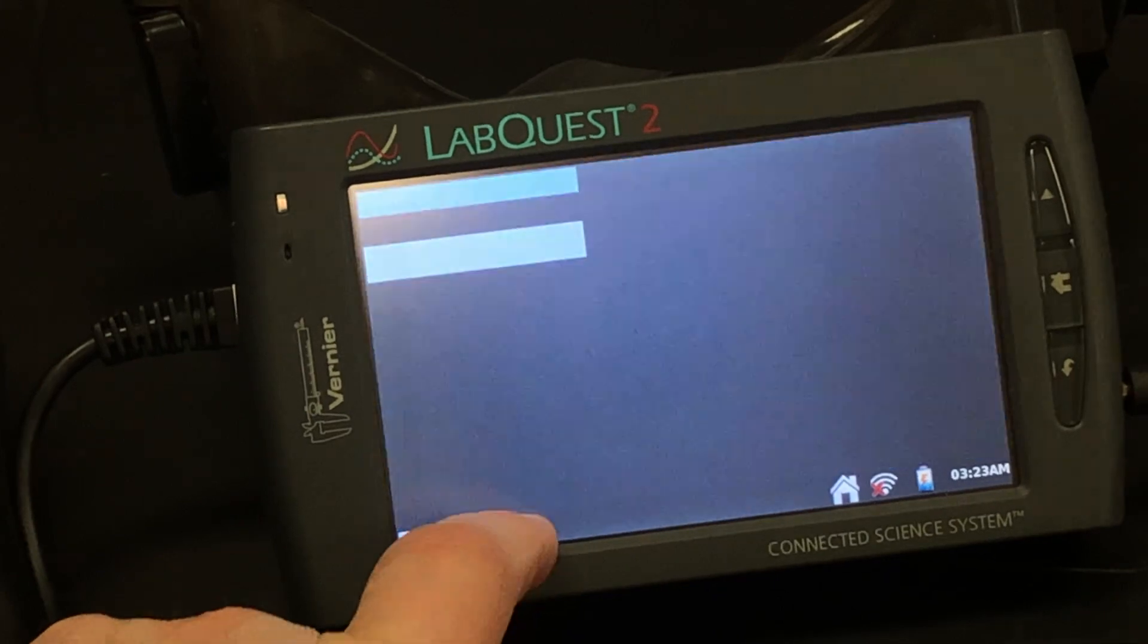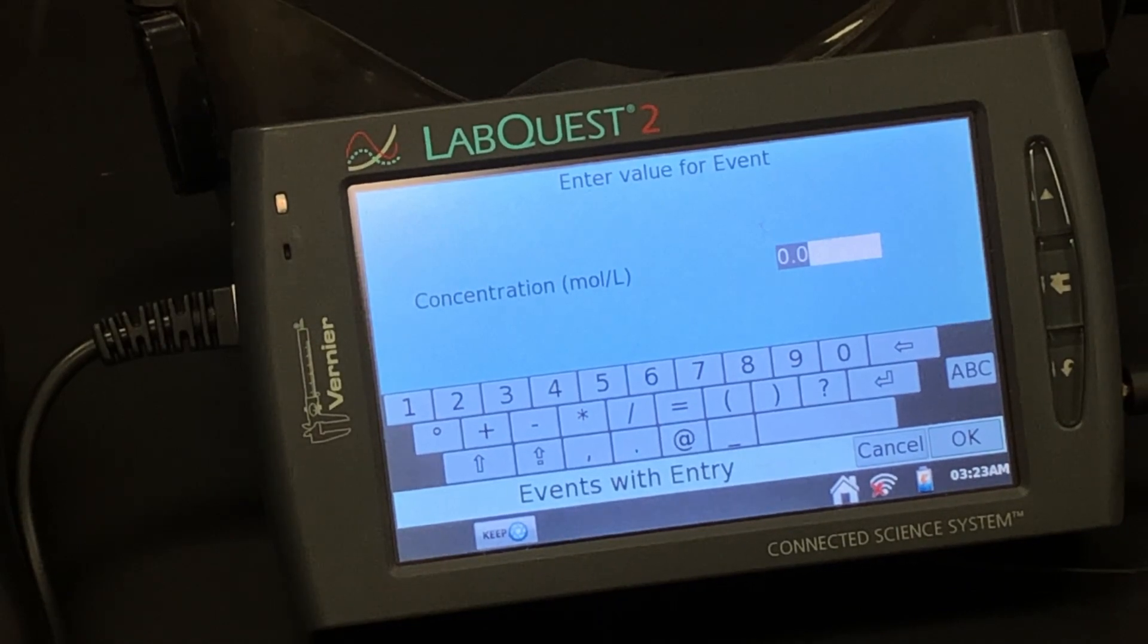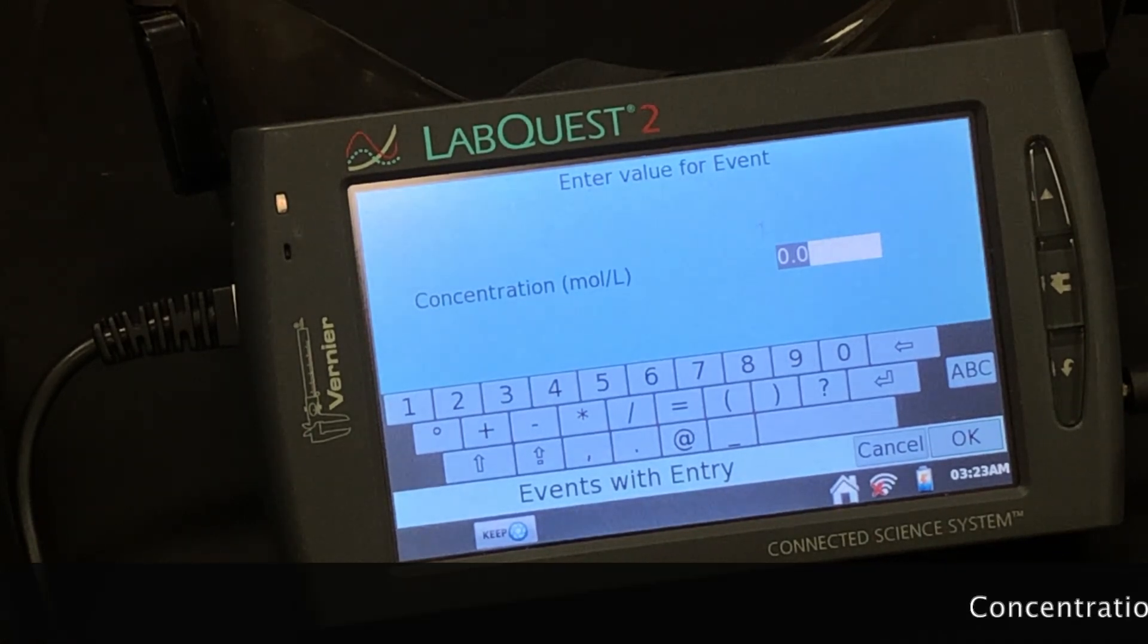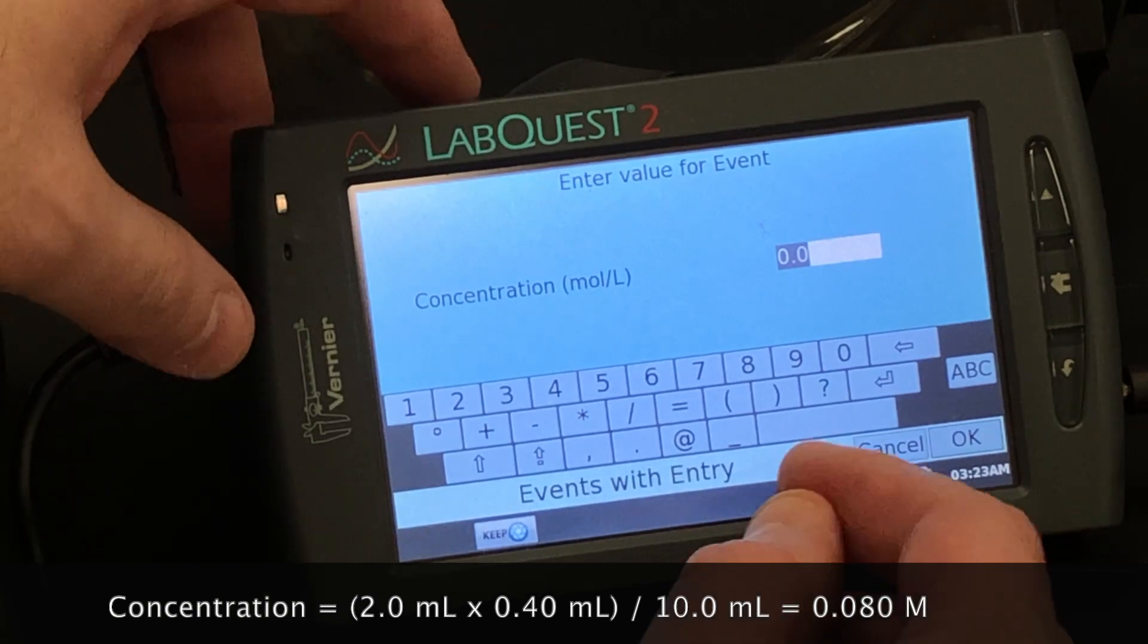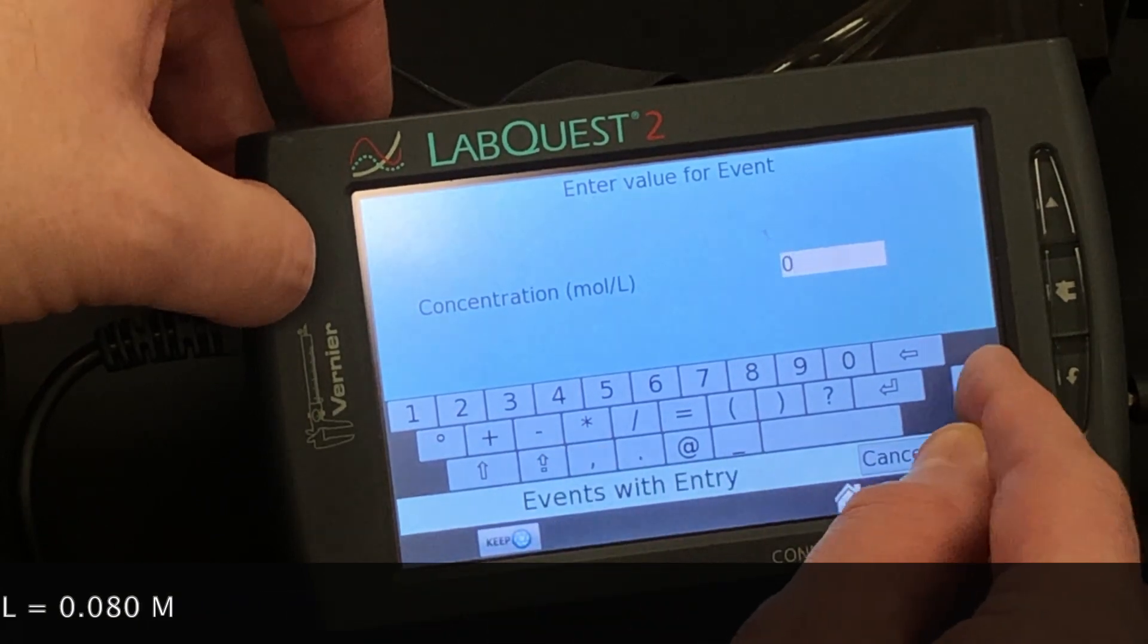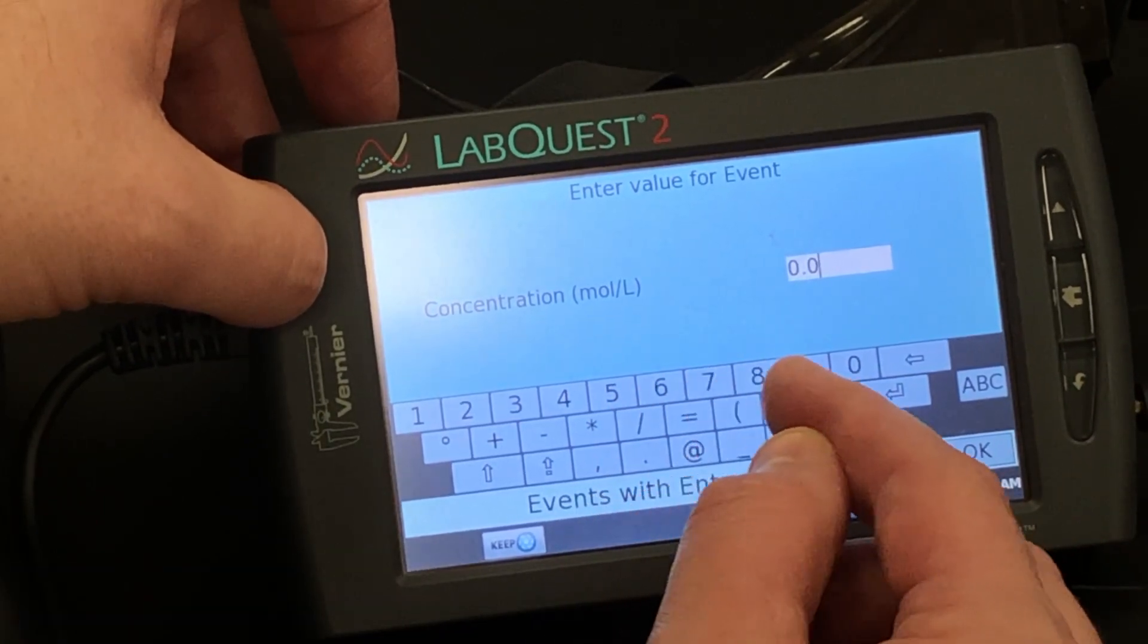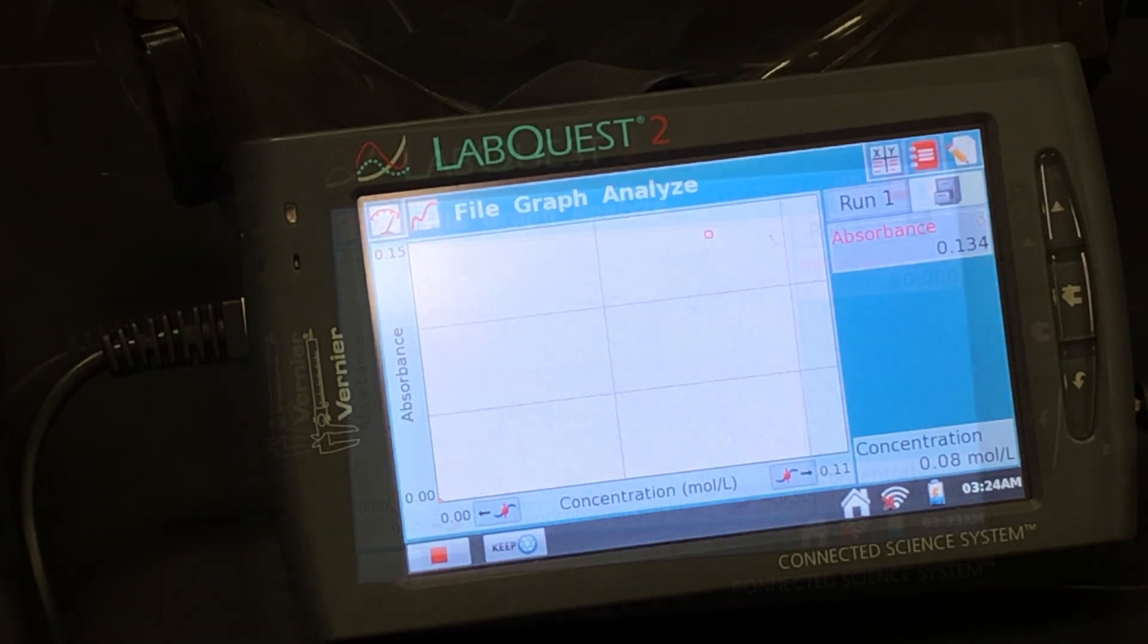Then once you do that, you hit keep, and it asks you, what is the concentration of this? In the solution that we had, it was 2 milliliters of copper sulfate. That's basically a 20% solution, or 0.2. We know that the starting concentration of the copper sulfate was 0.4, so it's 0.4 times 0.2, which is 0.08. So then you type in, using the touchscreen here, 0.08, and the concentration is in moles per liter. And you hit OK. And now you can see here there's a data point. So when we do that again and again, you'll see more points, and you'll see the shape of the curve unfold.